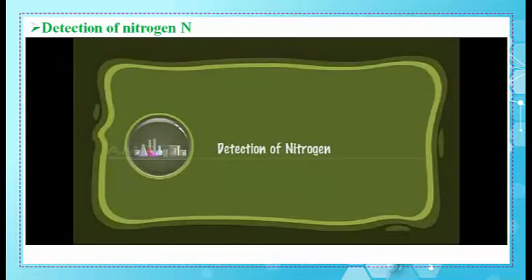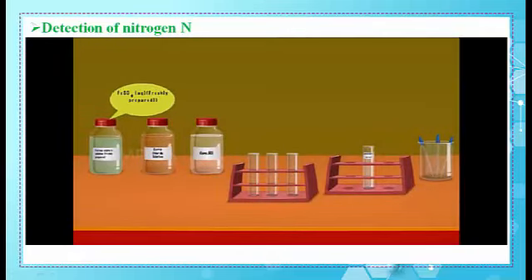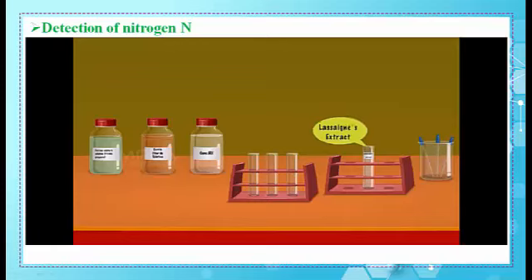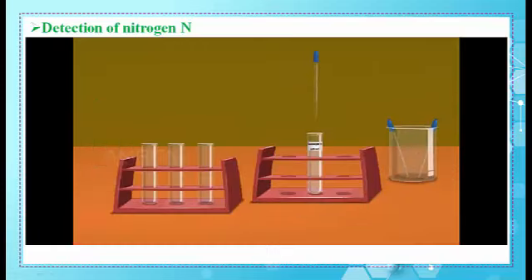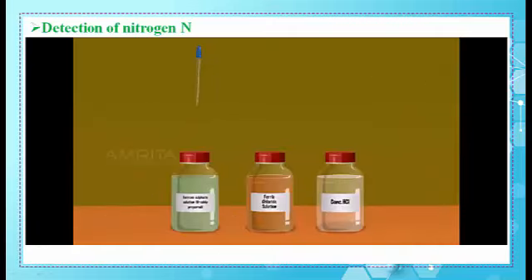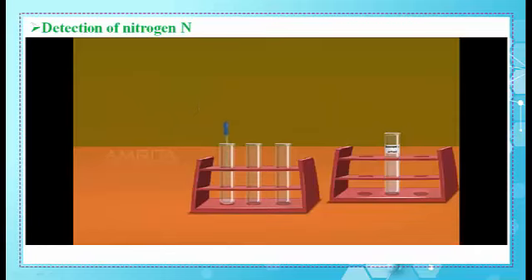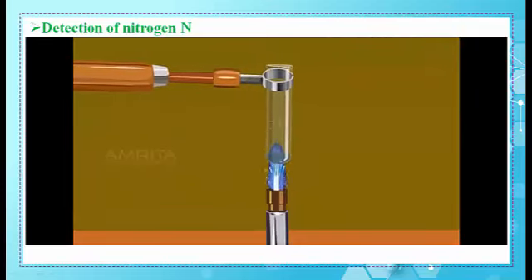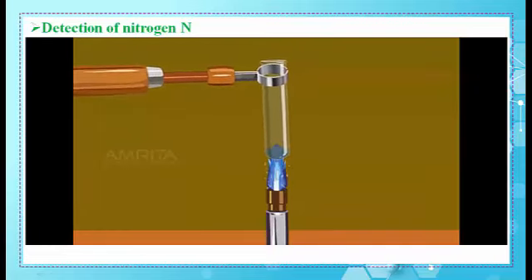Now, how can we identify the element nitrogen? Watch this video. Detection of nitrogen. We require freshly prepared ferrous sulfate solution, ferric chloride solution, concentrated hydrochloric acid, test tube, Lassaigne's extract, and droppers. Take a small amount of Lassaigne's extract using a dropper and pour it into a clean test tube. Using another dropper, take a small amount of freshly prepared ferrous sulfate solution. Pour ferrous sulfate solution into the test tube containing Lassaigne's extract and heat the test tube over the Bunsen burner. The sodium cyanide formed during the preparation of Lassaigne's extract is converted to sodium ferrocyanide on treating with ferrous sulfate.